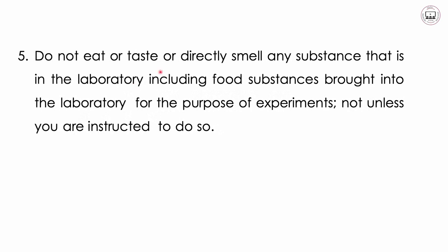Number 5, do not eat or taste or directly smell any substance that is in the laboratory, including food substances brought into the laboratory for the purpose of an experiment, unless you are instructed to do so. Remember, in the laboratory we conduct different kinds of experiments. Some of the things which might come to the laboratory are food items. You may be tempted to eat some of the food items, but the instruction tells you not to.